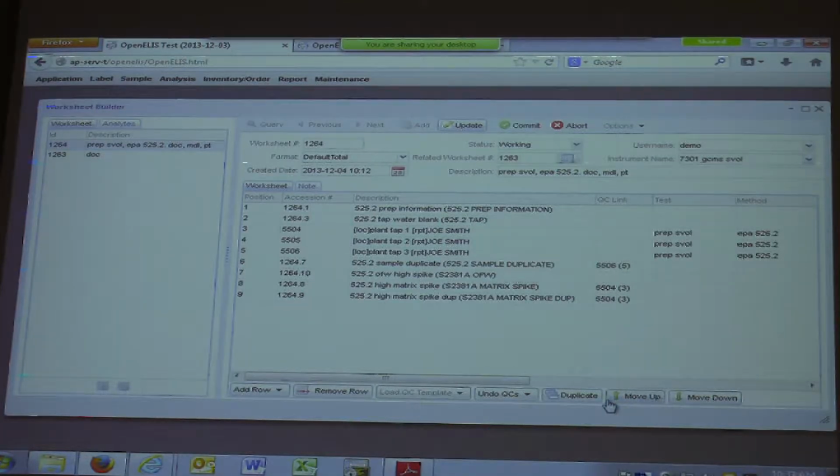And it's not going to renumber the accession number when you commit again? I'm working on that. There's a little minor bug with that right now. I don't think it does renumber that right now, but I'm working on fixing it. So it will eventually. And the fix, Matt, would be so that this position will match that position. Correct.